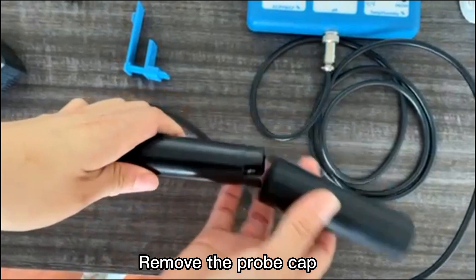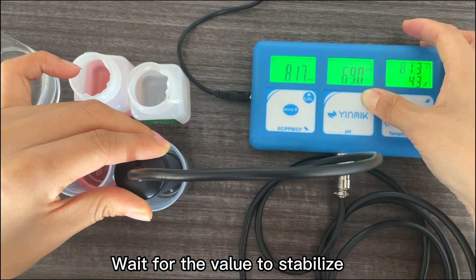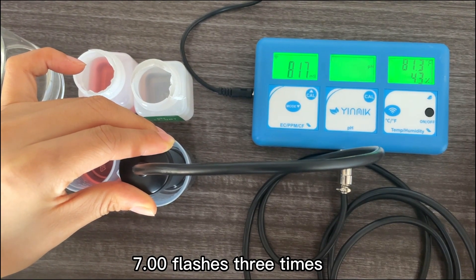Remove the probe cap and put the probe into the 7.00 buffer solution. Wait for the value to stabilize. Long press CAL — CAL is flashing. 7.00 flashes three times, confirming the first calibration point.